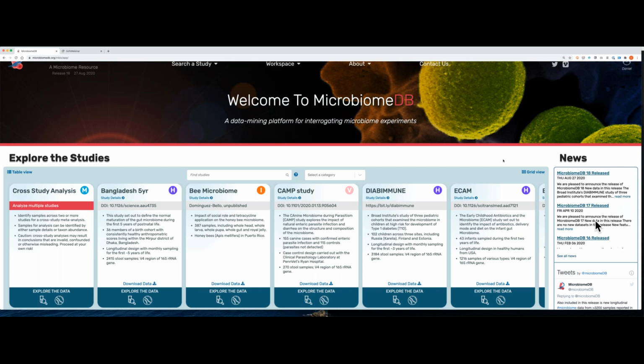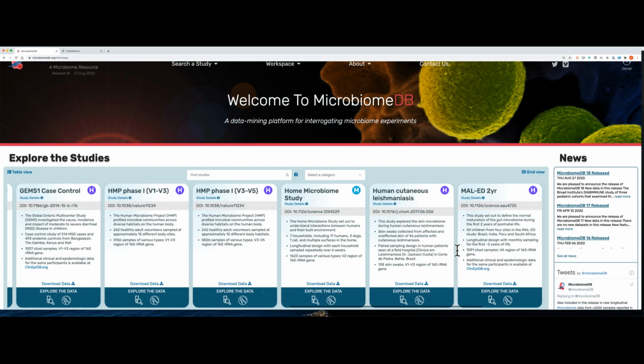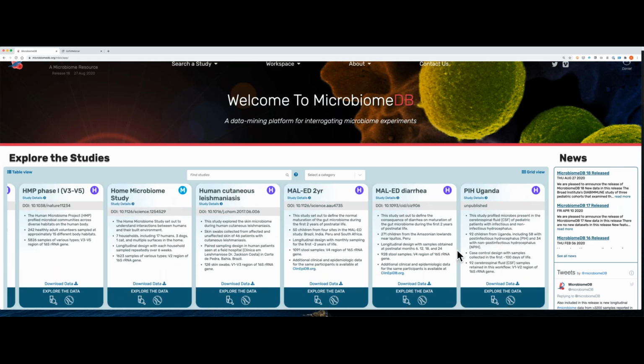He just wanted to indicate that our release policy does not require release. The data provider is always the one who makes the final call about whether they release their data or not. So that's right. That's a great point. We never release data without prior approval from the data provider. And a lot of times when we work with data providers to load data, in fact, always, there's a close interaction with that data provider. We look over the way the data is represented on the site with them. All of this is done ahead of any release of the data to our live site. So yeah, absolutely. Thanks for bringing that up, David.